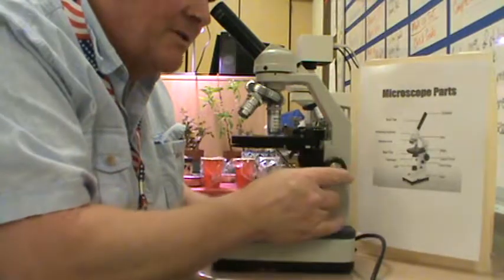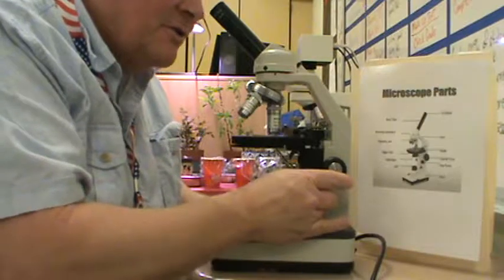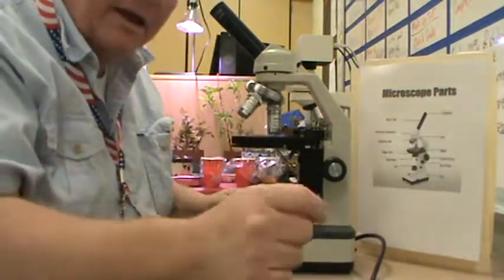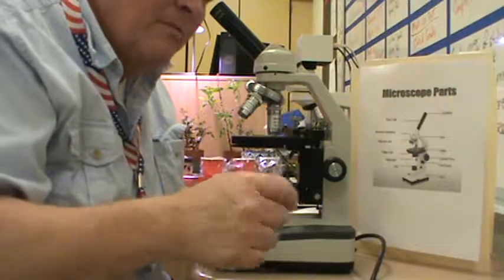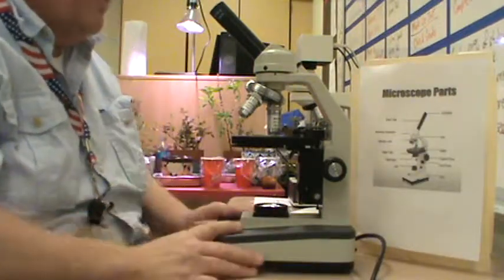But what I'm looking at is what's further down in here is my sample. In this case, it's lung tissue. I can then, using my open eye over here, I can have my notebook. I can take notes while I'm looking. I can sketch, come back to what I'm looking at. Makes it very easy if I keep both eyes open.